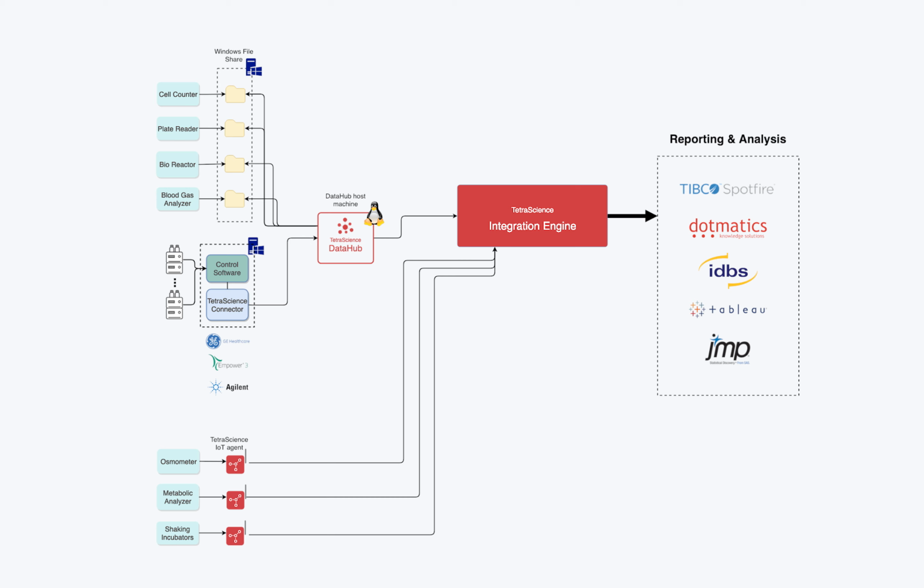Upon connecting additional instruments, we are on our way to integrating across our bioprocess development, eliminating manual data transcription and streamlining our process.